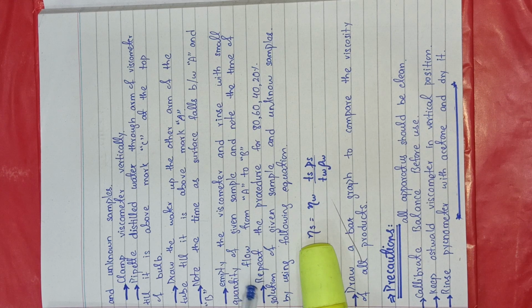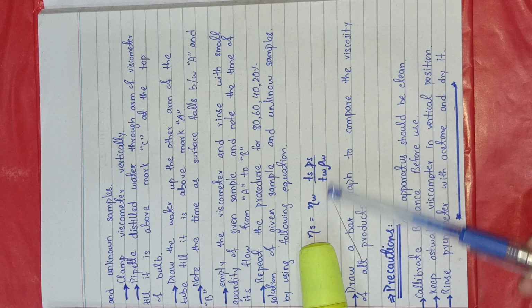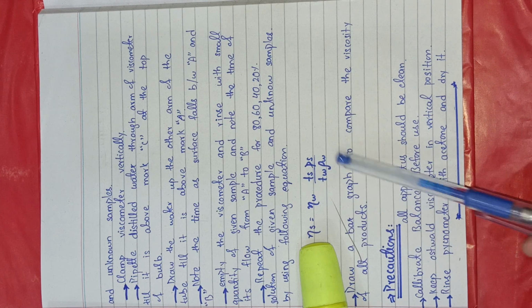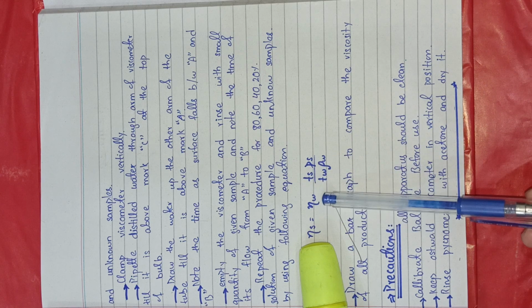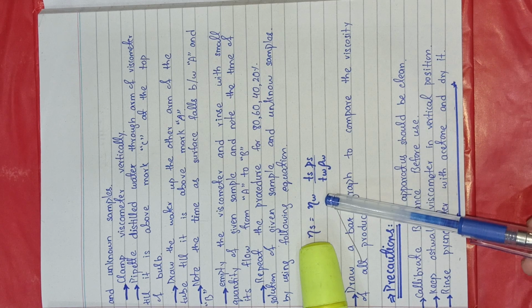You are going to follow an equation for it, and this is that equation: eta s is equal to eta w times t s times rho s over t w times rho w. By putting the values in that equation you are going to find your real answer. So this is the viscosity of water which you must know.